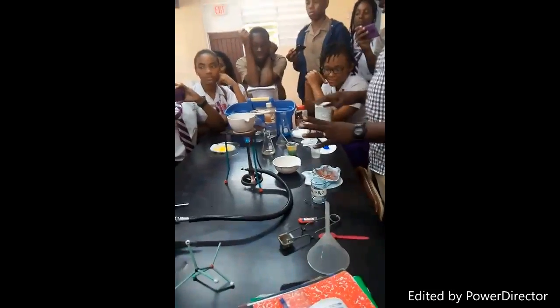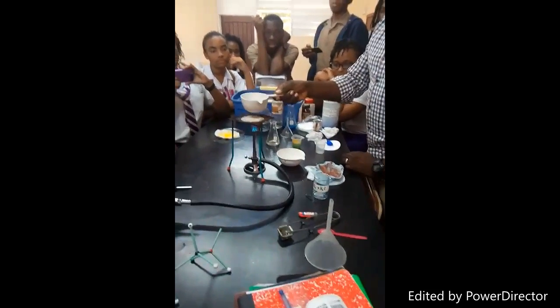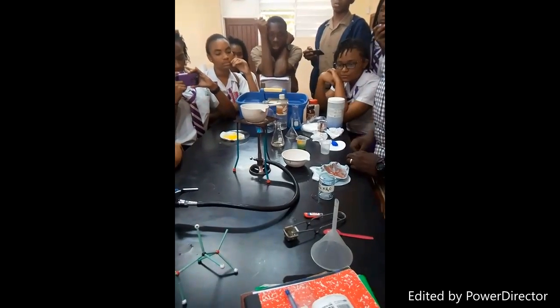We have made that. We're done with that now. We want to make our copper sulfate now. Let us get it cooking.